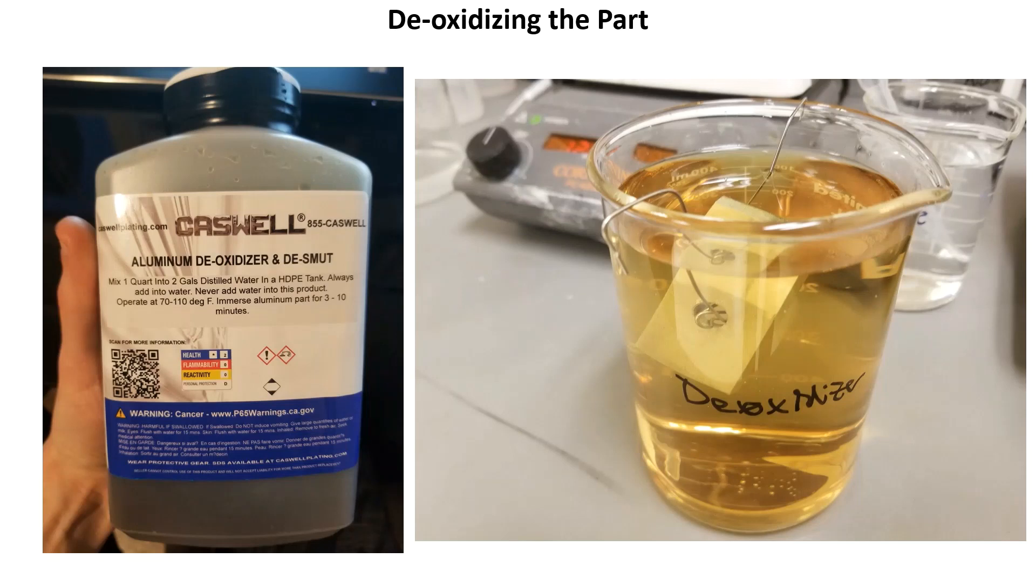After I confirmed water break free with the DI water and the part was thoroughly rinsed, I needed to deoxidize it. All oxidation needs to be stripped off of the part for the anodizing process to create a new and completely uniform oxidization layer. I used a Caswell chemical for this in a solution of 125 milliliters of chemical per liter of DI water at 45 degrees C without agitation. The part was soaked for three minutes then rinsed with DI water.